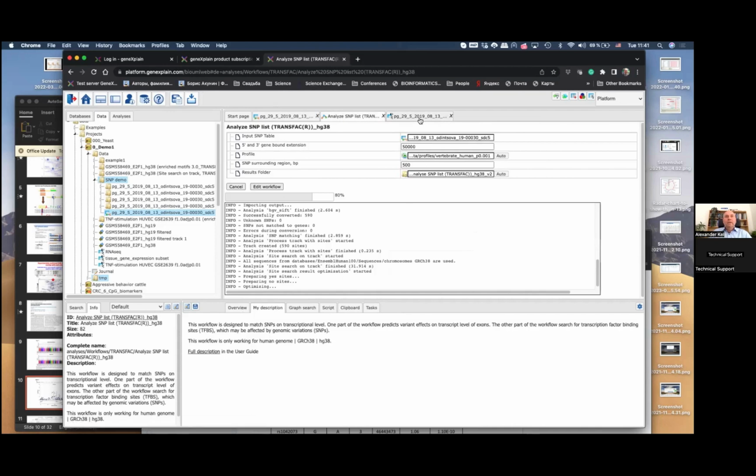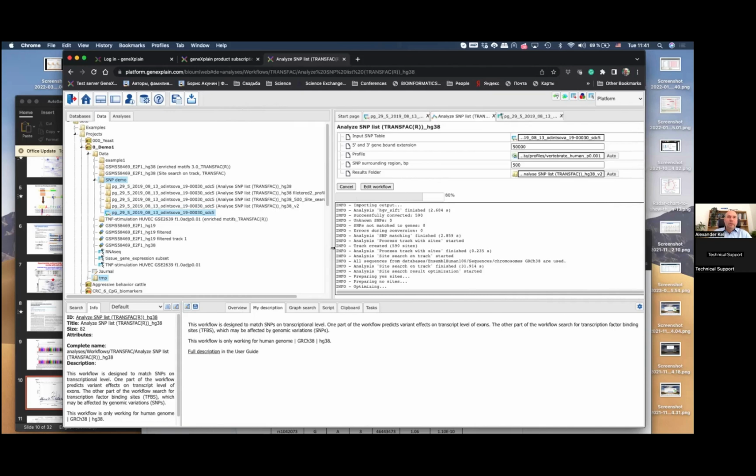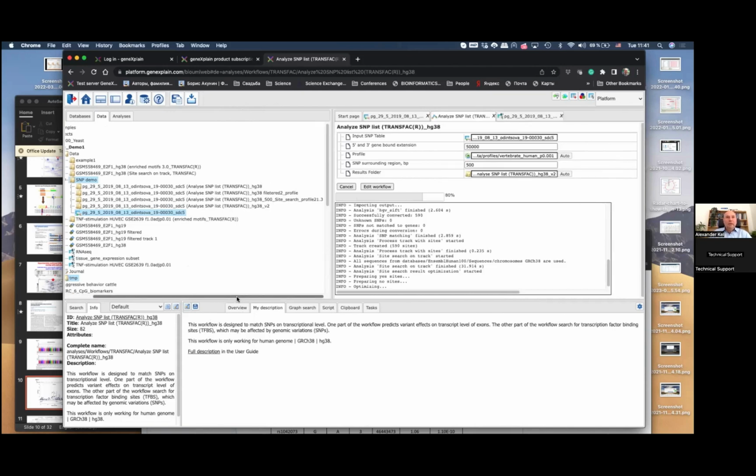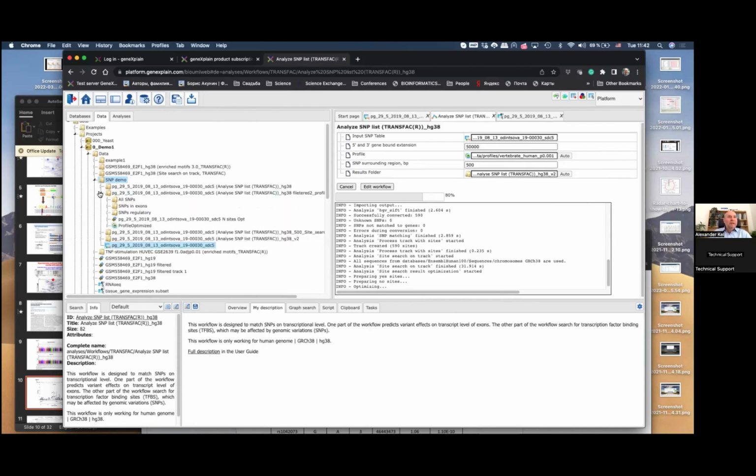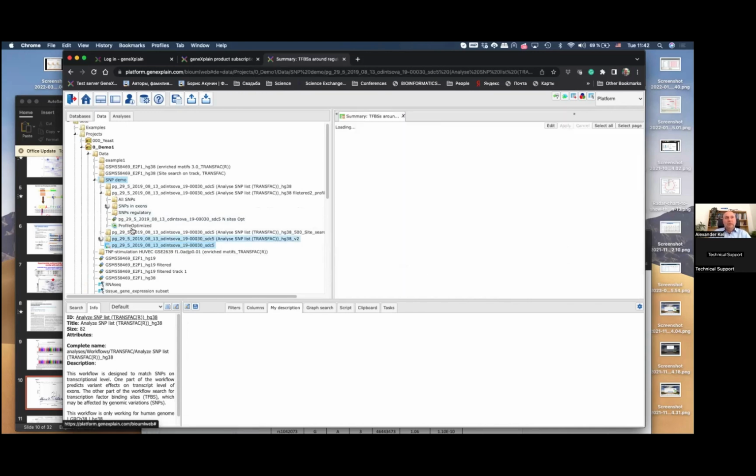yeah, it's still running. So we can actually go to the pre-computed analysis. I did it before starting our seminar. So it's here. That's the output which you see. What it does is first split the SNPs according to where they are located, whether they are fitting the exons of the genes.